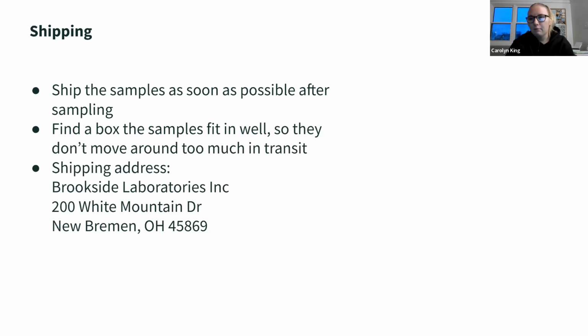So taping them shut, definitely. Yeah, that's right. Making sure that the samples get to the lab all in one piece and that it's not a box full of loose soil that ends up at the lab. We've definitely been there and done that. So make sure that you get them packaged together, good and tight, and get them to the lab as quickly as we can.